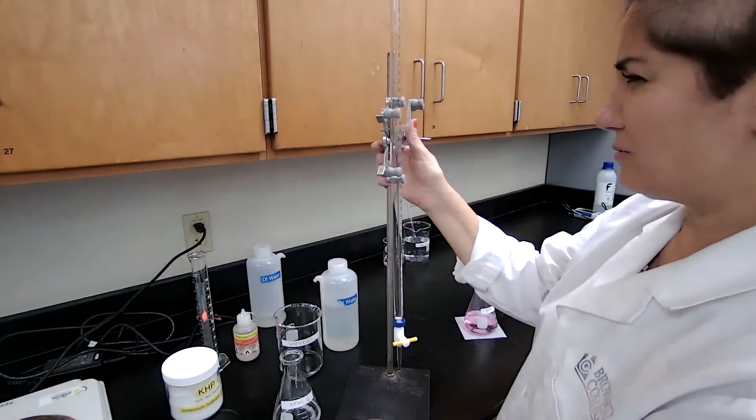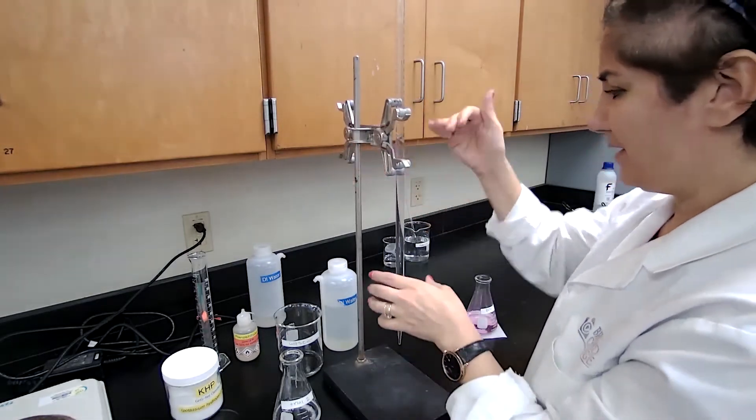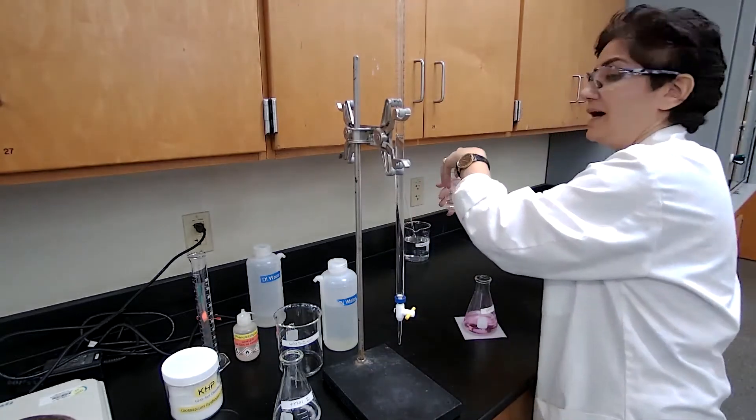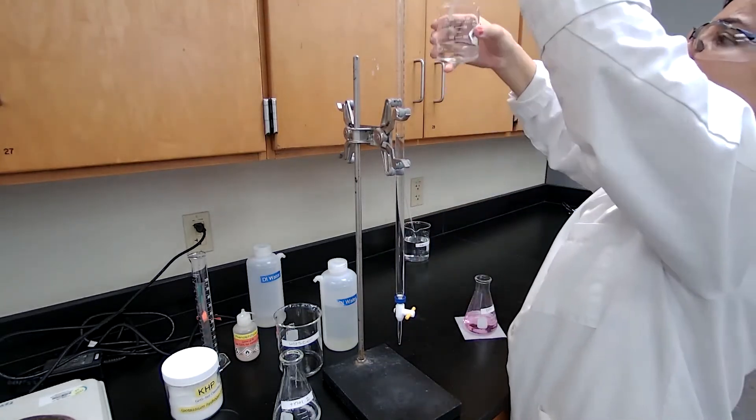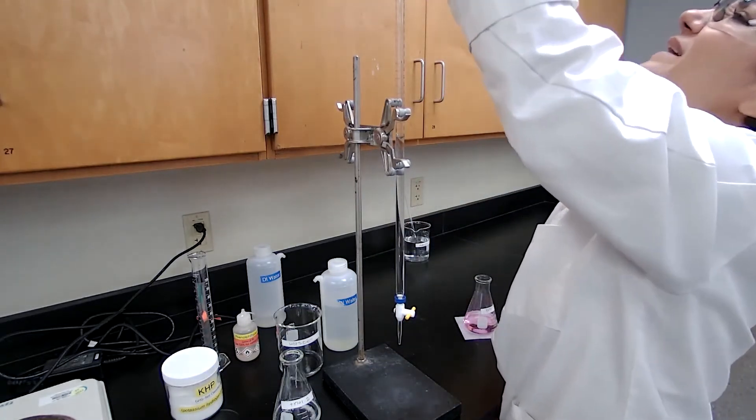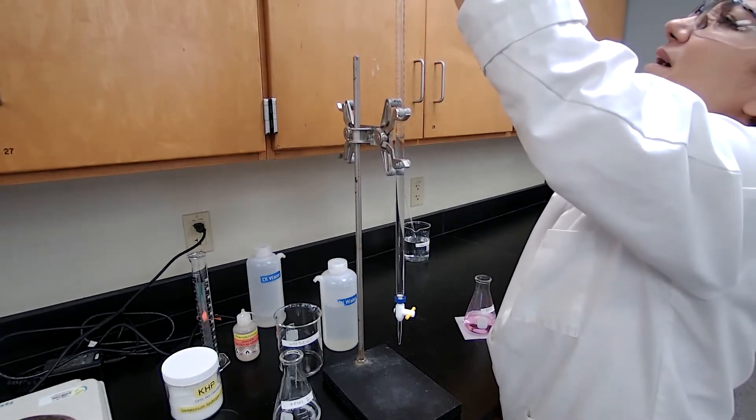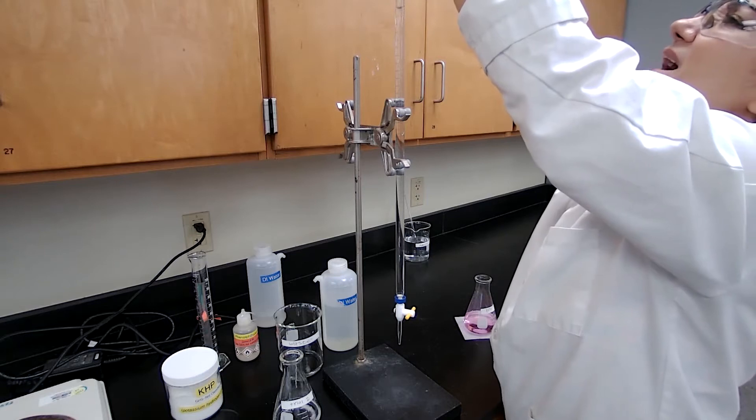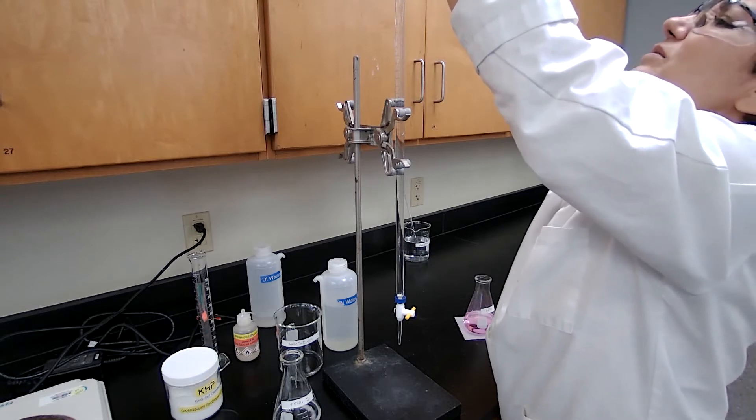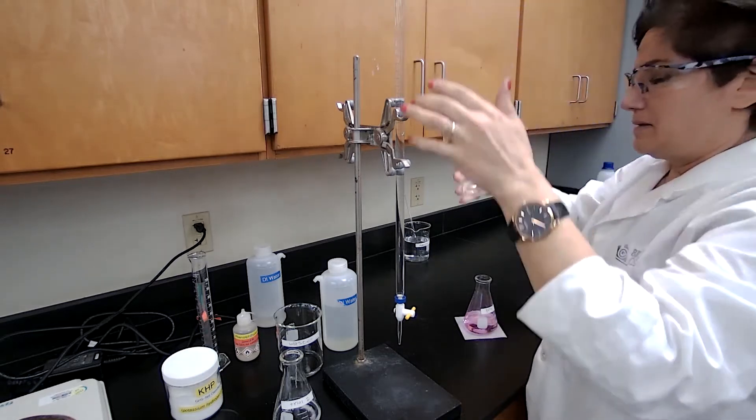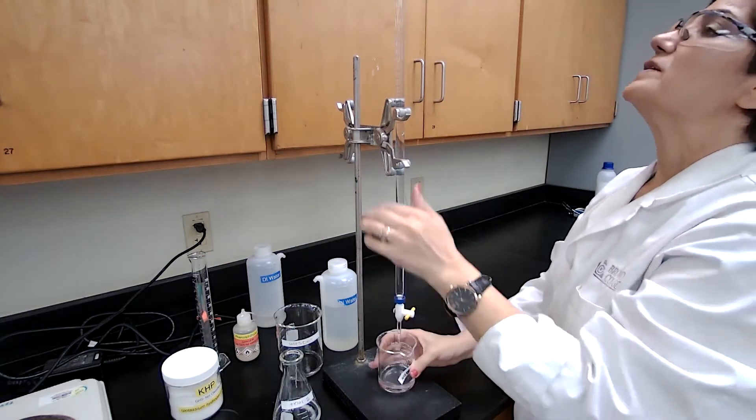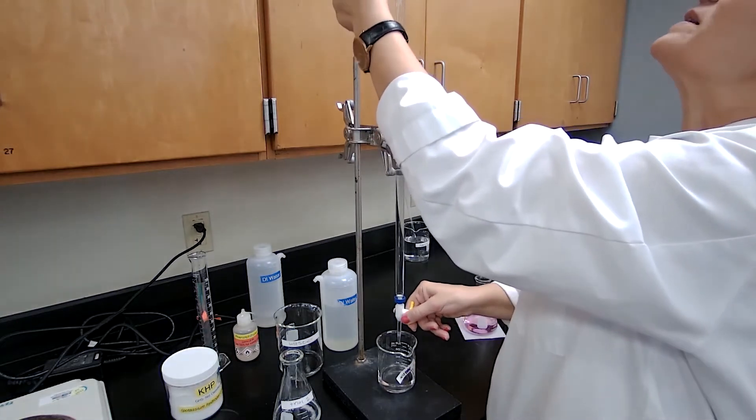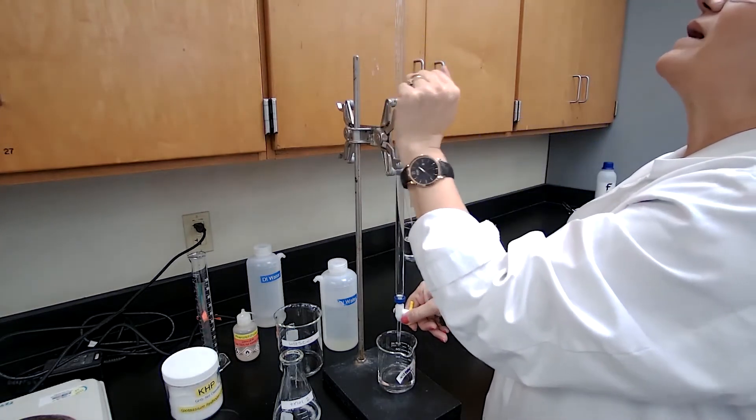For trial two, since I used 30 milliliters, I don't have enough of the sodium hydroxide in the burette. I need to refill it. But I don't have to go to zero. I can refill it to any number, as long as I make sure that I have about 30 milliliters or more in the burette. So I'm going to adjust this time at 10. The meniscus would be at 10 exactly.